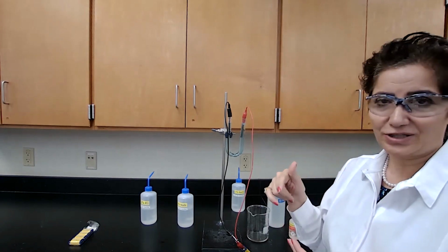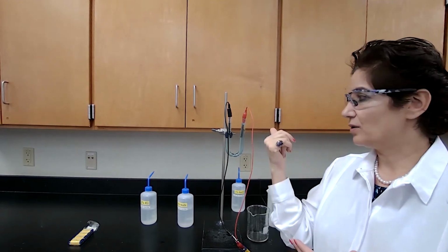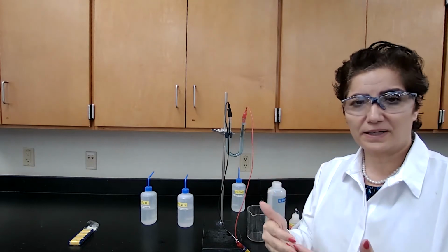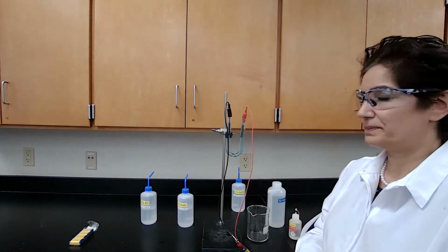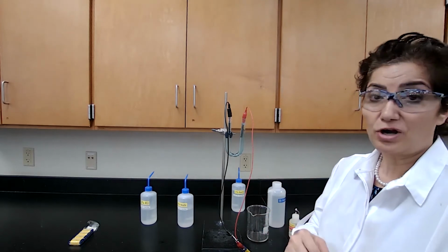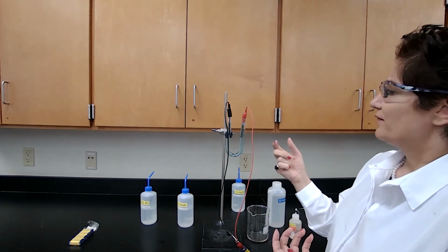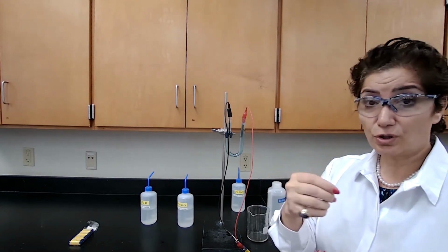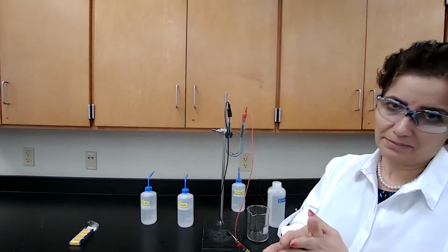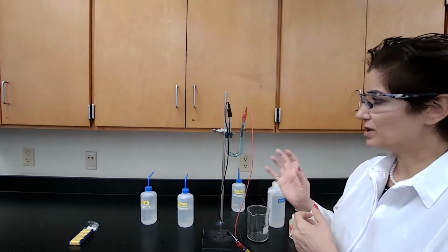In this reaction, water is not being reduced because we don't have the pink color. I just have to wait and see the copper residue collect enough copper for me to show you, especially through the camera. So I'm giving some time for this reaction to happen.